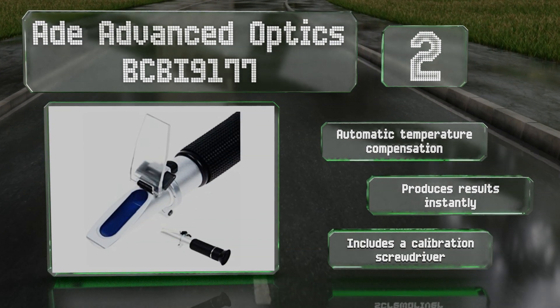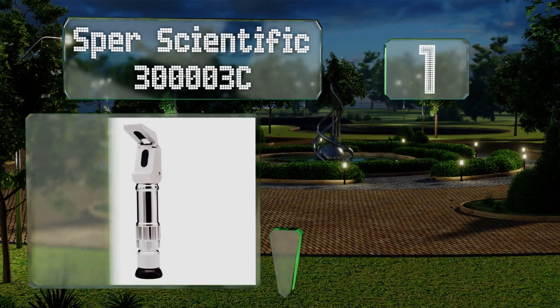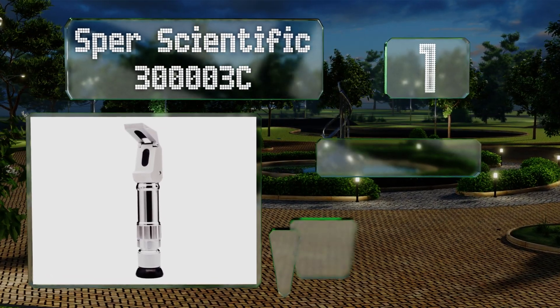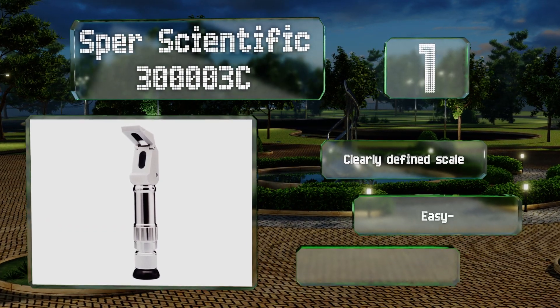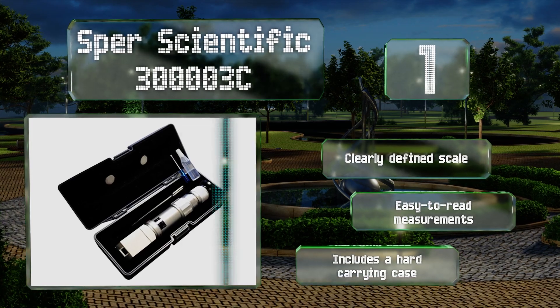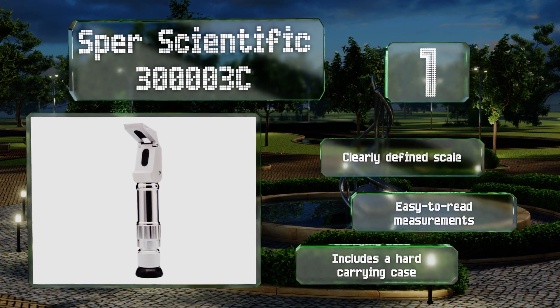And coming in at number 1 on our list, the Spur Scientific 30000003C comes with a certificate of calibration, making it suitable for use in labs, on production lines, and in science classes where precision is needed. Its wide brix range of 0 to 80% makes it good for testing products with unknown sugar contents. It comes with a clearly defined scale, easy-to-read measurements, and a hard carrying case.